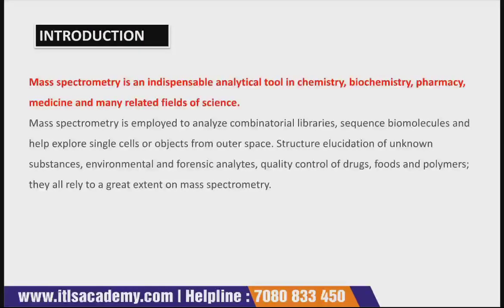So let's get started with the topic and let's see the introduction part. What is mass spectrometry? This is a question we have asked for every technique we have learned so far. So today we will start with mass spectrometry. It is a very powerful analytical technique that is used to quantify known materials as well as to identify unknown compounds present in a sample. It is also used where you want to know the chemical properties of different molecules. This technique basically studies the effect of ionizing energy on molecules.